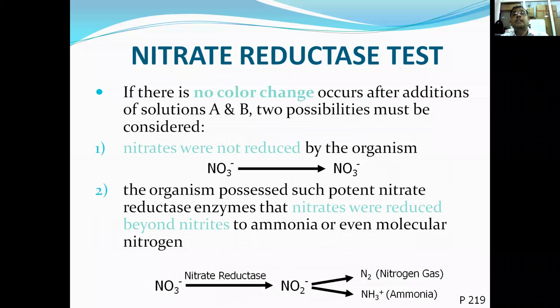But there is a scenario where there is no color change on addition of solution A and B. Then there might be 2 possibilities. One possibility is that nitrate was not reduced, so nitrate is present as such in that particular broth.